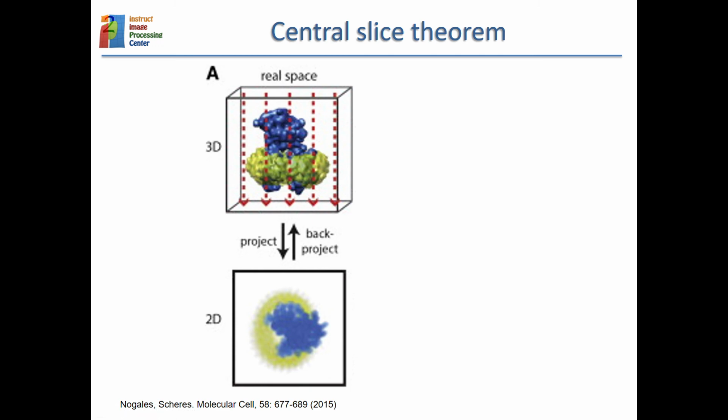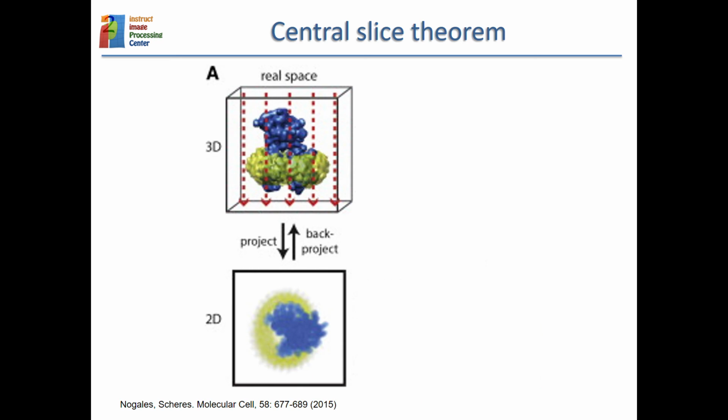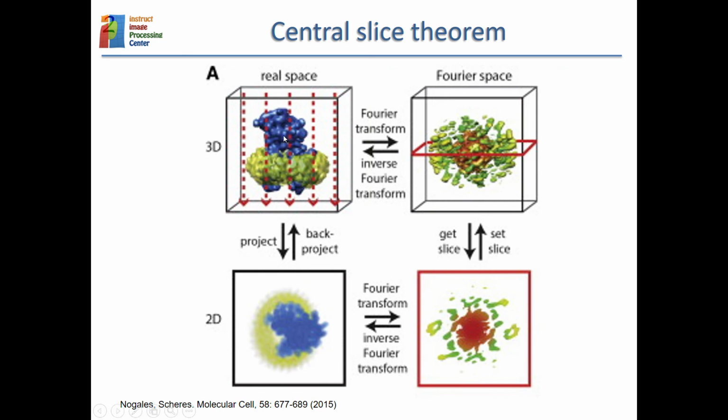And the central slice theorem says that if you take the Fourier transform of this projection, that is another 2D image, and you do the 3D Fourier transform, so there are also 3D waves, of the original object, then these coefficients here are exactly the same coefficients that you have in a central slice of the 3D Fourier transform of the original object, so central means going through the origin. So these coefficients are exactly these ones.